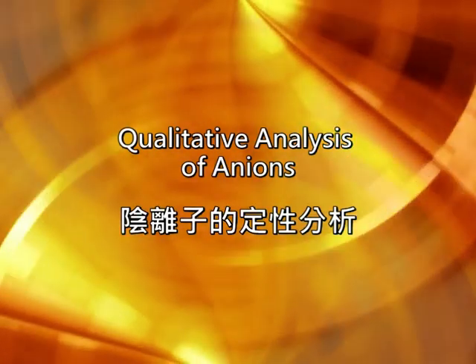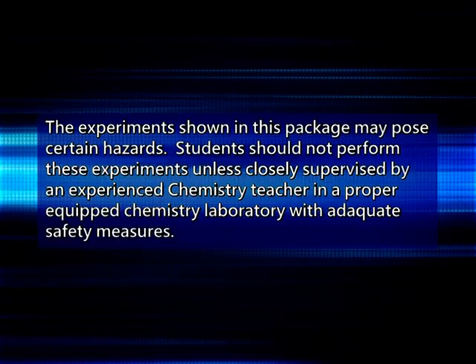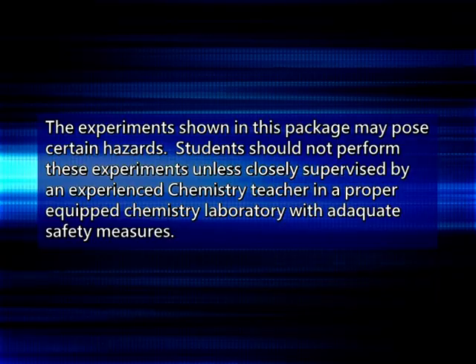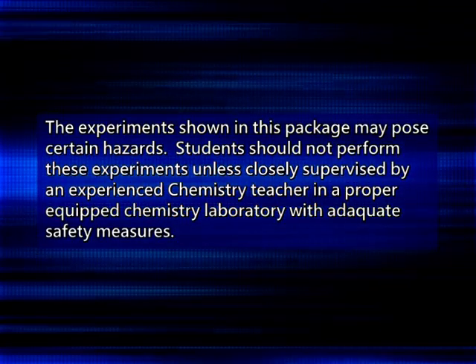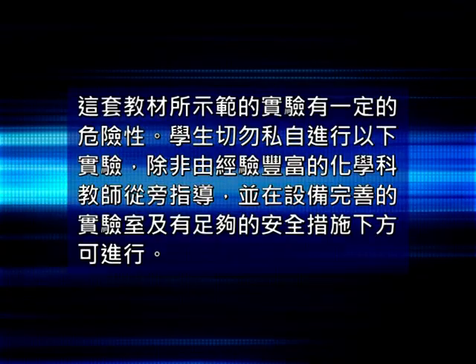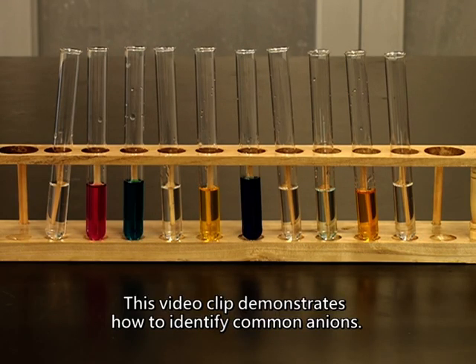Qualitative analysis of anions. This video clip demonstrates how to identify common anions.